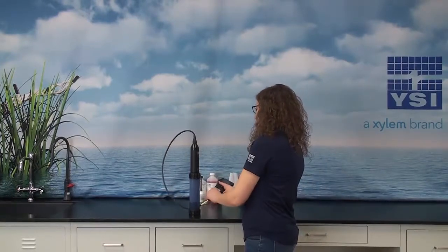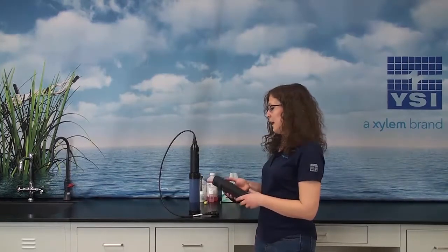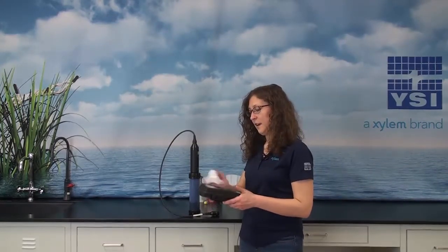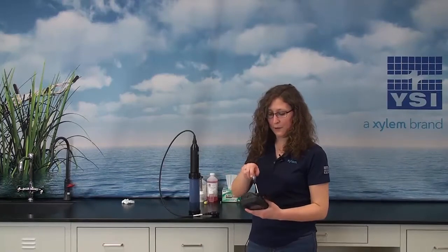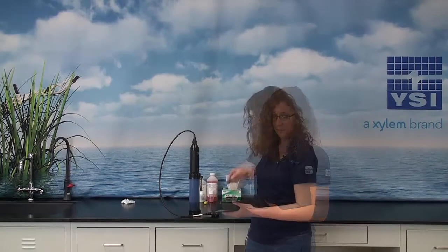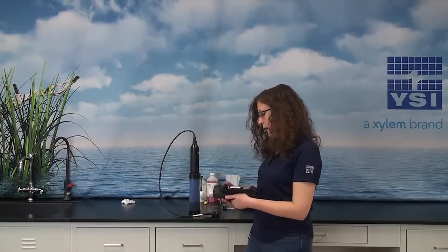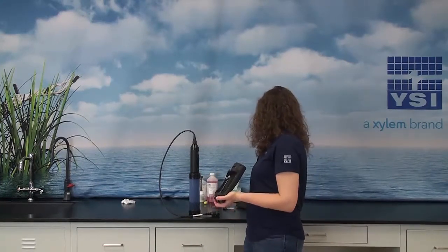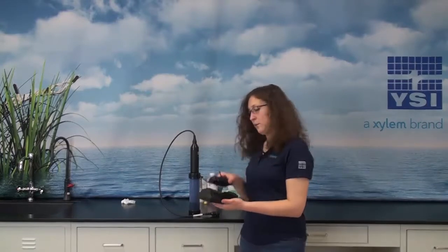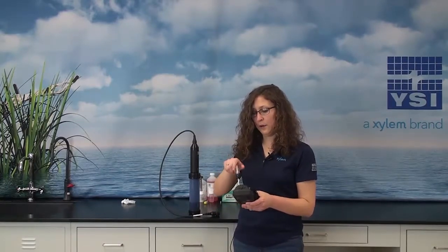For long-term storage, you'll want to remove the cable from the ProDSS. Make sure that the handheld is nice and clean. We'll remove the lithium-ion battery pack from the handheld — all you need to do is unplug this plug. Be sure to keep the battery pack in a clean, dry space. We'll also replace the cover on the handheld to protect the battery compartment during storage.